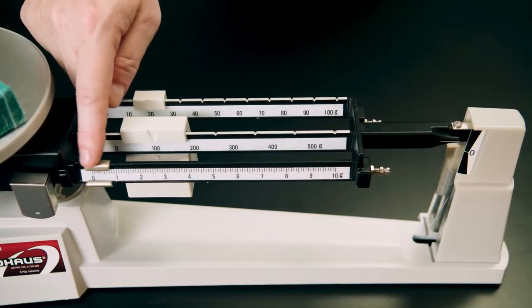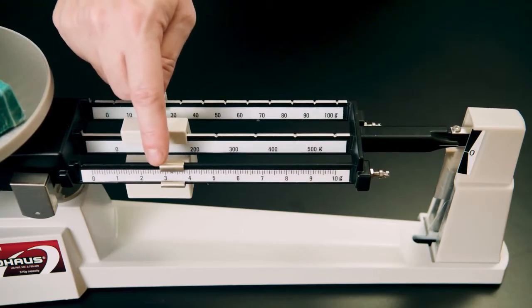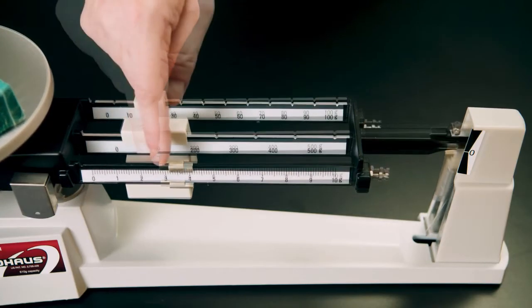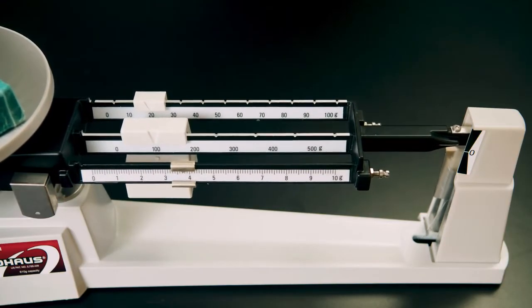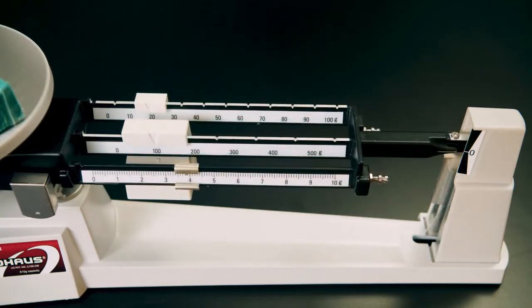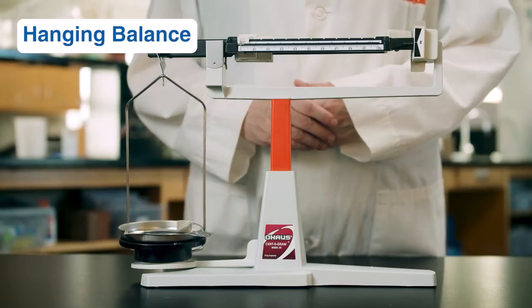Move the mass on the beam that measures in the smallest increments last. Gently tap it forward until the pointer points at the 0 value. If the pointer goes below 0, tap it backwards until you reach 0. You now have the mass of the object. To read the mass from the triple beam balance, read the value on each beam. In this case, 100 grams, 20 grams, and 3.8 grams. Add these values together to get the mass of the object. In this case, 123.8 grams.